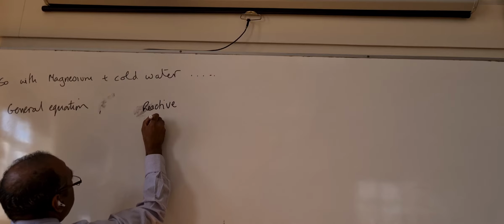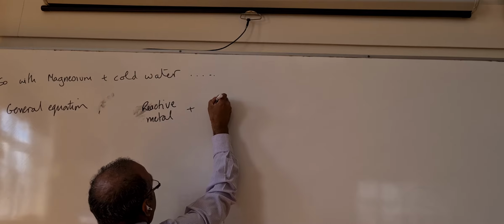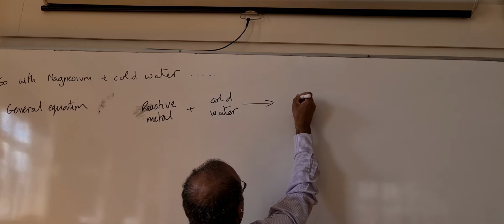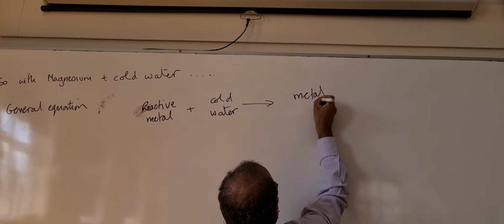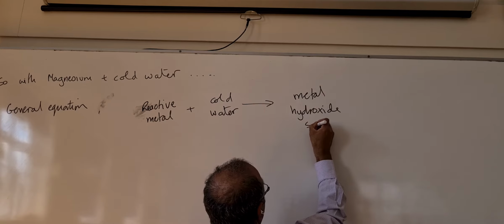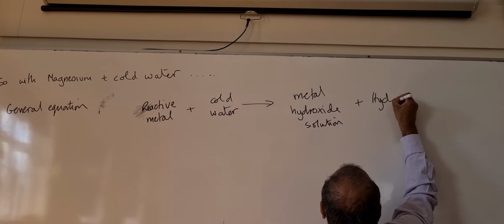So if the metal is reactive enough, reactive metal plus, let's write cold water, will make metal hydroxide solution plus hydrogen gas.